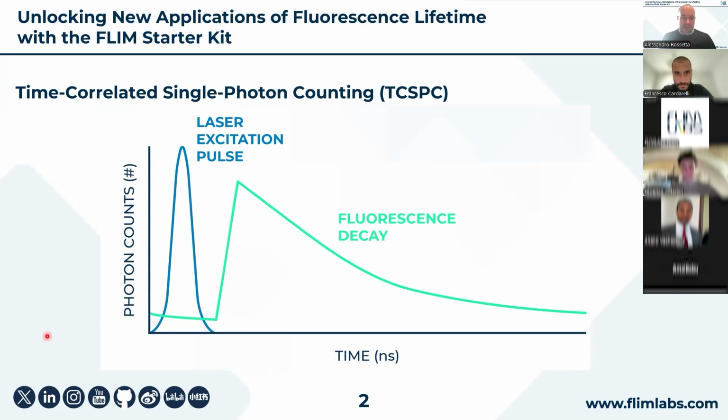Within the context of laser-induced fluorescence, we use time-correlated single-photon counting to basically be able to reconstruct the decay profile of our intensity signal after we excite the sample with a very short laser pulse. So this is, let's say, the technique at the base of our technology.